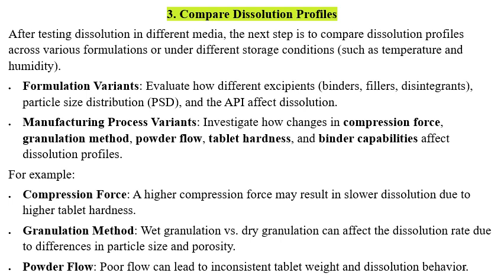The example here, compression force I have considered for tablet formulation. A higher compression force may result in a slower dissolution due to higher tablet hardness. Granulation method. Wet granulation versus dry granulation can affect the dissolution rate due to the differences in particle size and porosity. Powder flow. Poor flow can lead to inconsistent tablet weight and dissolution behavior. But many times powder flow is not considered because powder flow is a secondary parameter and it is not directly related. But still I have considered it here.